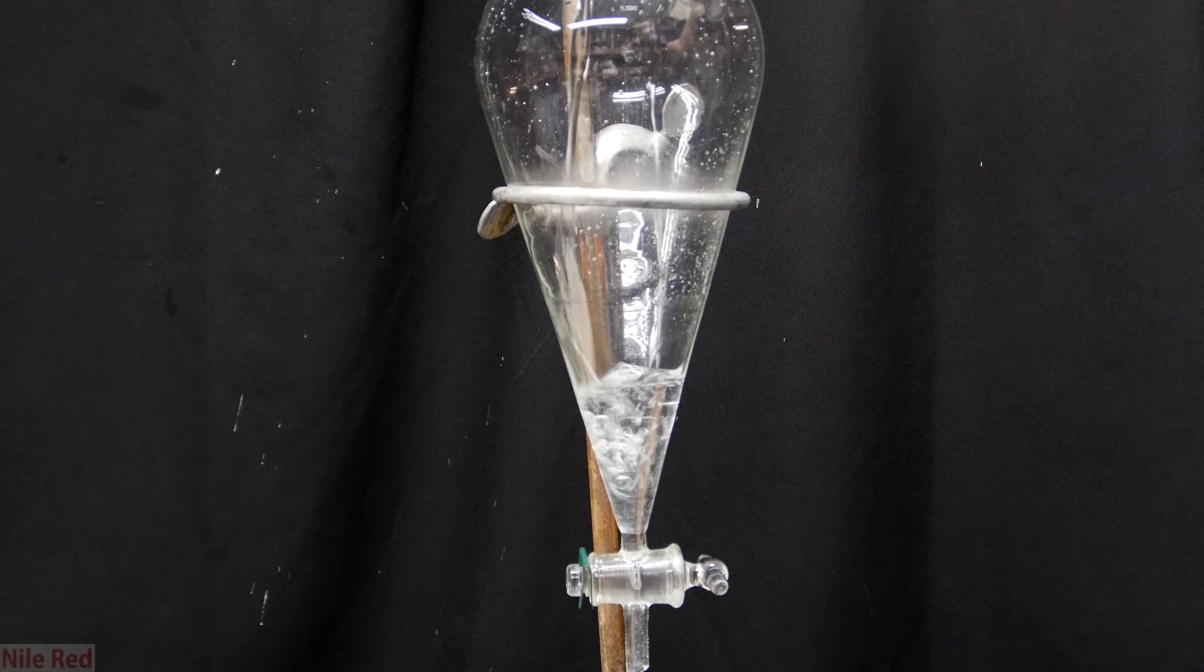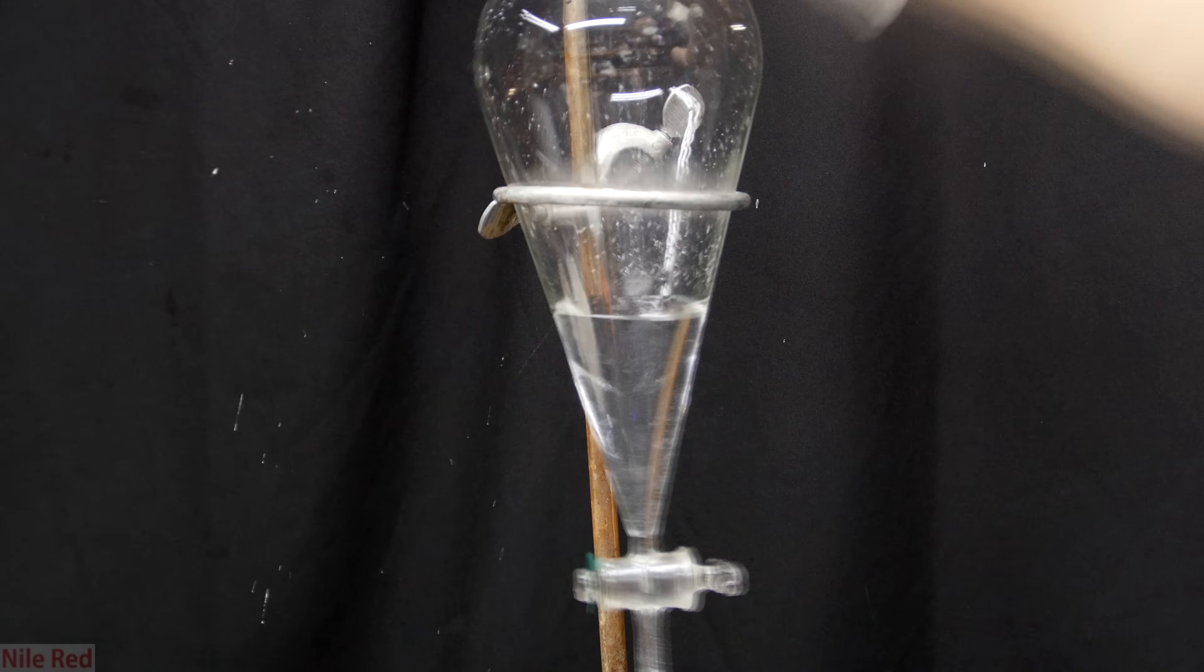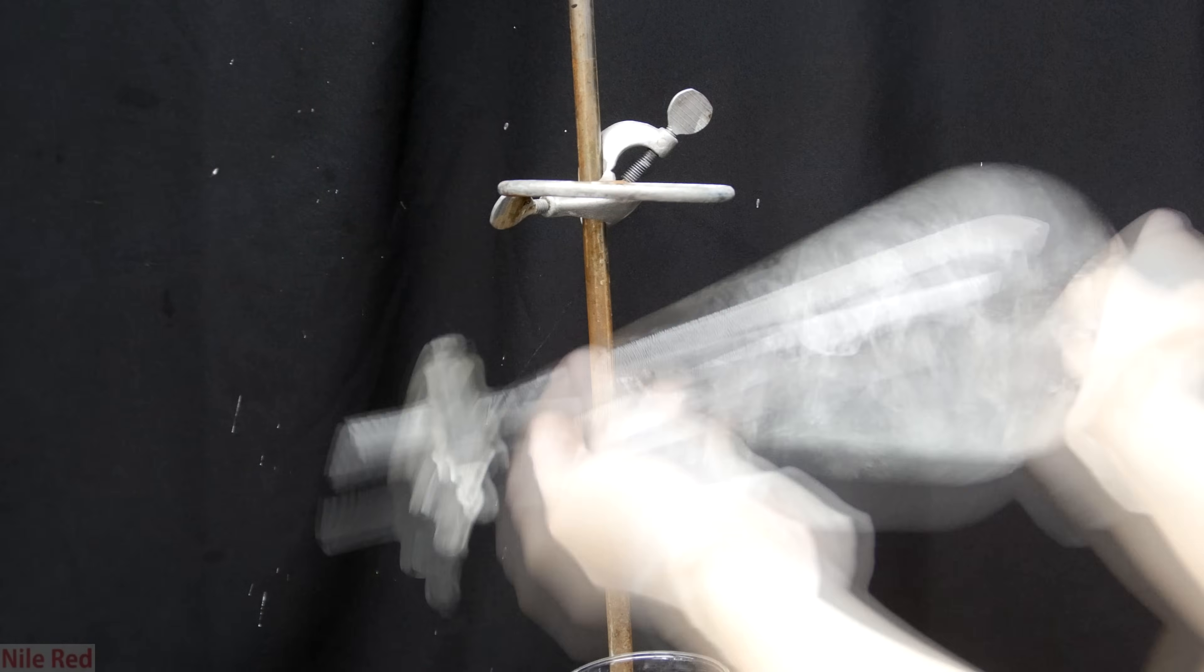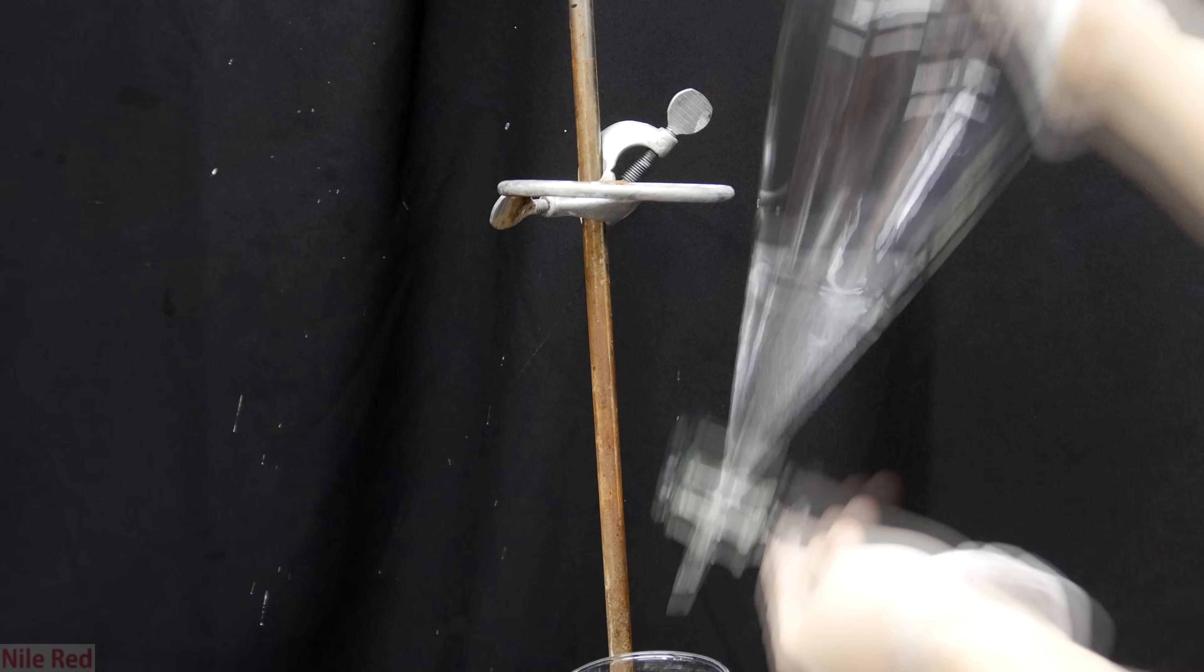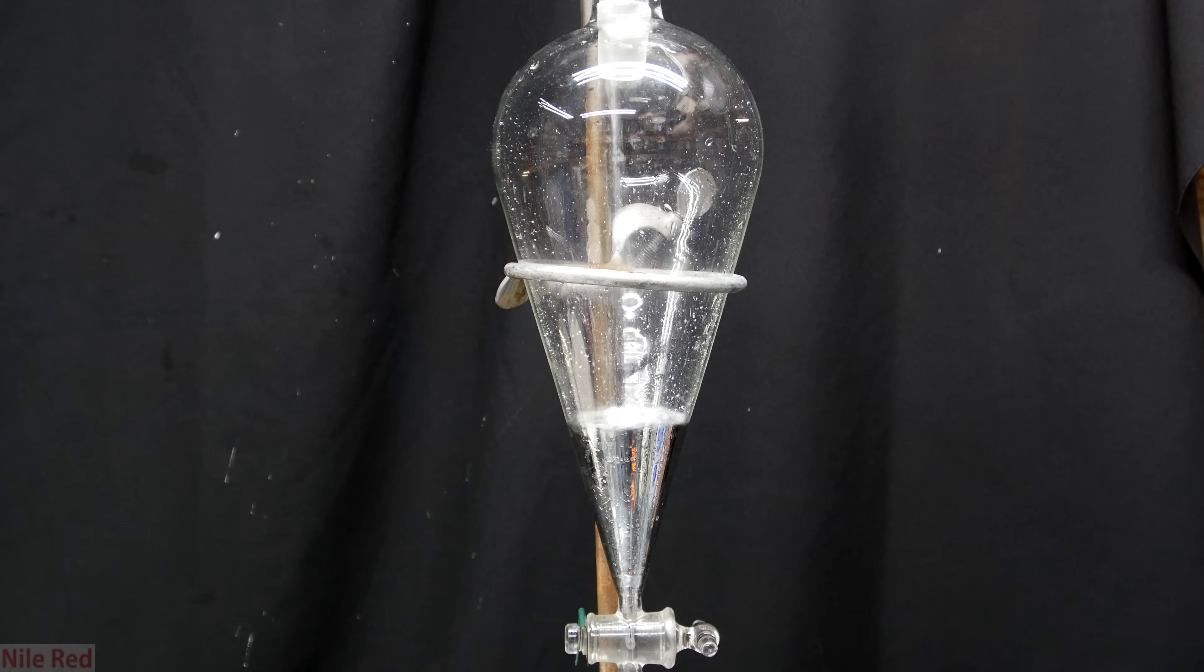Before re-adding the mercury back to the separatory funnel, it's washed out with a little bit of water. So the separatory funnel is capped and shaken and then the water waste is collected in the same beaker. Now that the separatory funnel is cleaner, we can re-add the mercury.